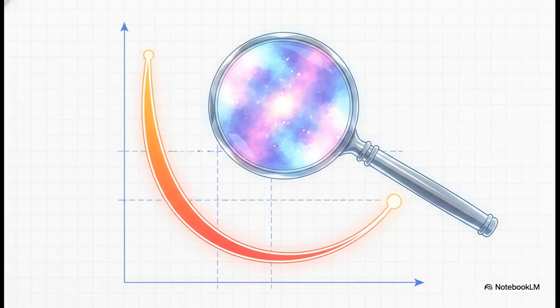While it is incredibly popular and great for seeing the big picture and overall geometric patterns, it has one major shortcoming. Going back to our detective metaphor, the Nyquist plot is basically like finding a perfectly preserved footprint from your prime suspect. You know exactly what shoe they wear, but the plot gives you absolutely zero idea when the footprint was left at the scene. The frequency data, which is the critical time component of our interrogation, is completely hidden. Looking at any single data point on that curve just won't tell you what frequency was used to record it. Though, as a general rule of thumb, points on the lower left usually correspond to the highest, fastest frequencies.